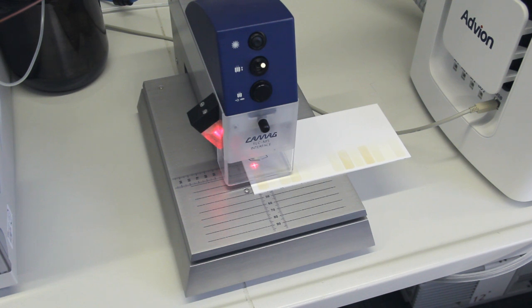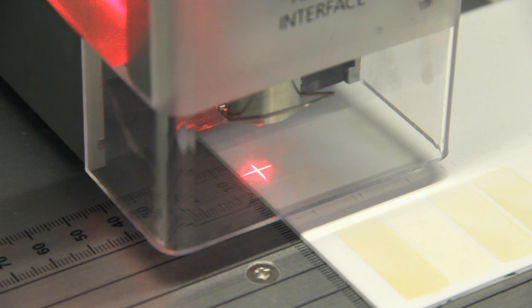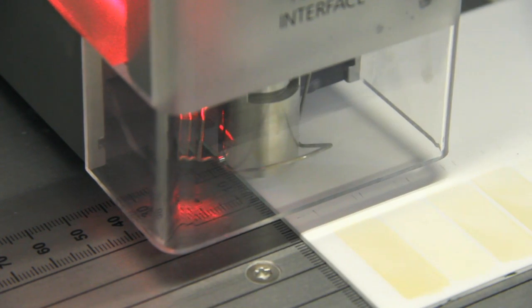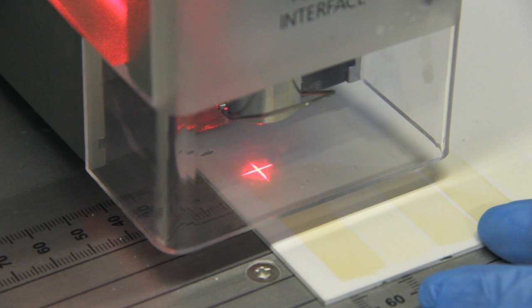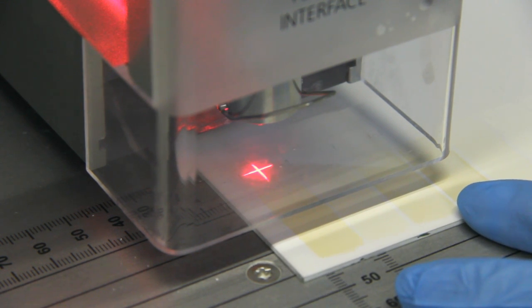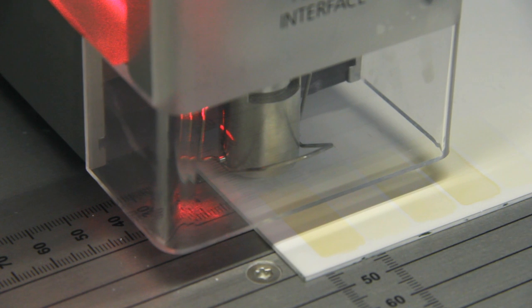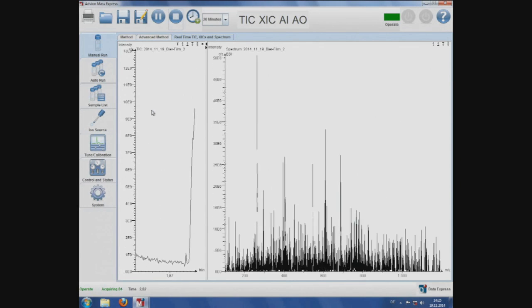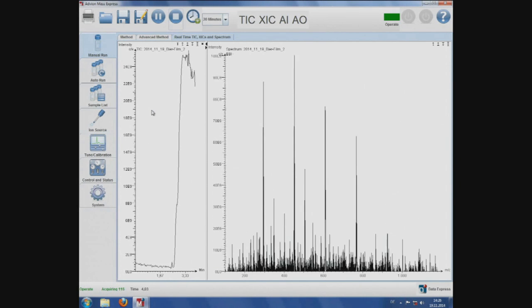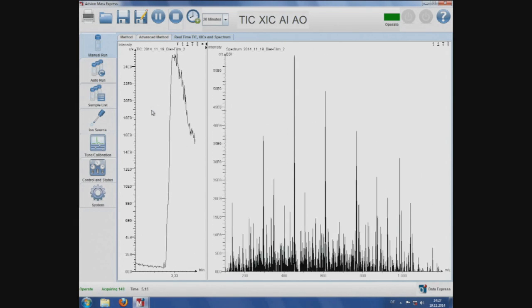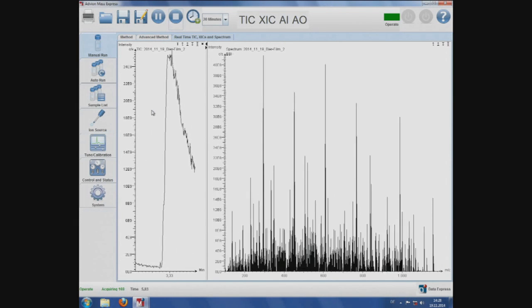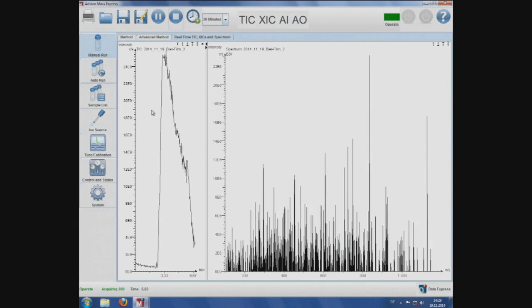Directed by a red laser cross, the zone of interest was positioned below the oval elution head. After elution of a blank, representing mass signals of plate background, solvents and MS system, the zone of interest was eluted at a flow rate of 0.1 mL per minute, using a 49 to 1 mixture of methanol and a 10 mmol ammonium formate buffer of pH 4. The software Advion Mass Express recorded the elution chronogram in the negative ion mode, first of the blank at around 3 minutes, then of the estrogen-effective zone at approximately 7 minutes.